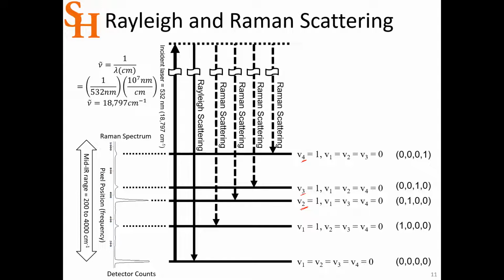If you're saying, I'm assigning this peak to 1537 wave numbers because it's close, and it has the right intensity to match what I see in the Raman spectrum, and then the one that is closer in frequency doesn't match in terms of intensity. So that's the kind of explanation that I would be looking for.